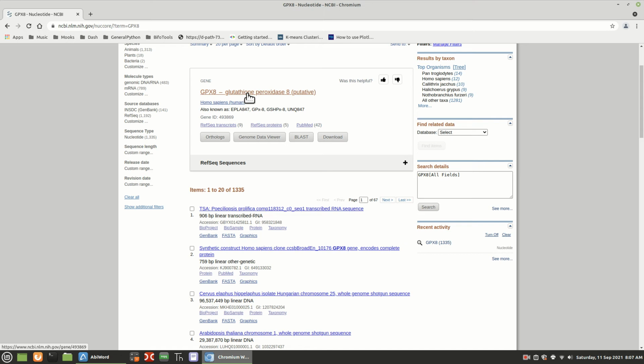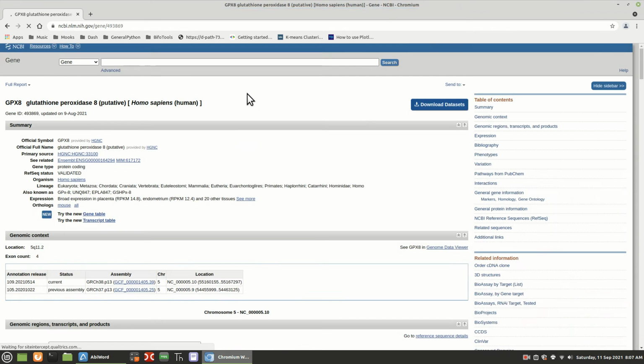I'm going to go ahead and go here and see if this is genomic. It's better to get genomic data. I'll show you more on how to find it exactly every time if it exists. But you may not be able to find genomic data. You may only be able to find RNA data. And if so, that's fine.